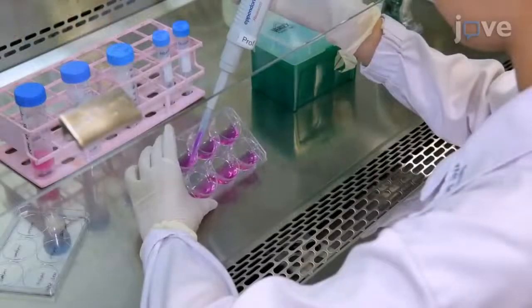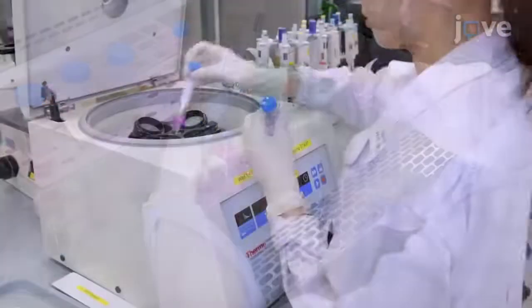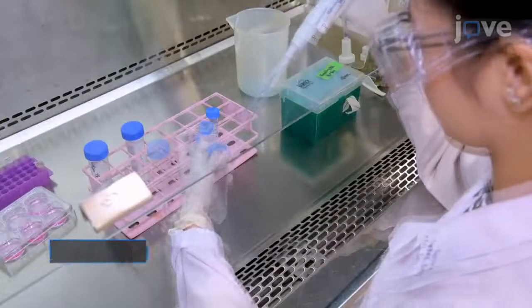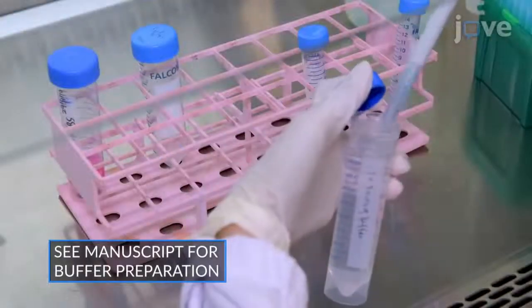At each time point, collect the cells into a 15 mL centrifuge tube and centrifuge at 300 times G for 5 minutes. Wash the cell pellets twice with phosphate-buffered saline and then resuspend the cells with 1× binding buffer.